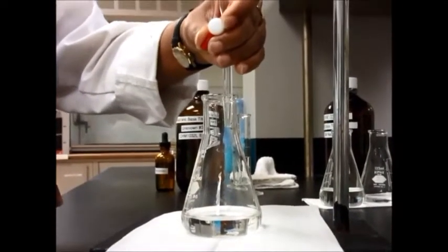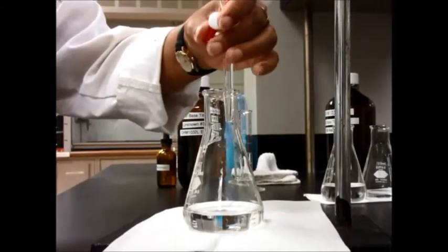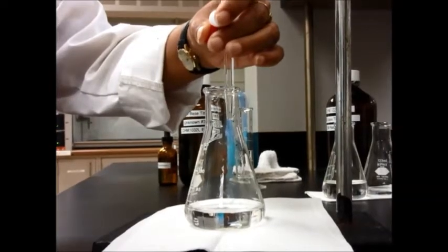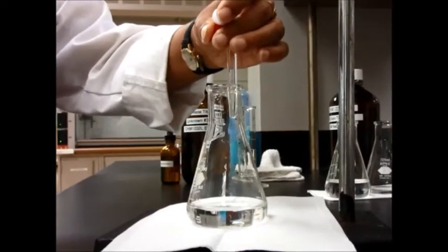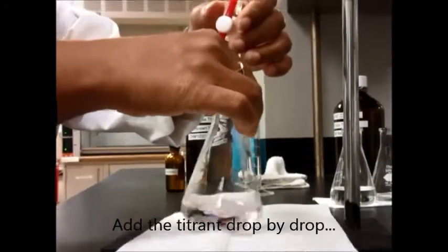From here, go really slowly. I'm right-handed so I use my left hand to control the stopcock and my right hand to shake the flask. If you're working with a partner, one of you can shake the flask.